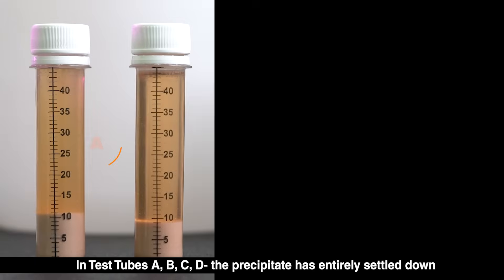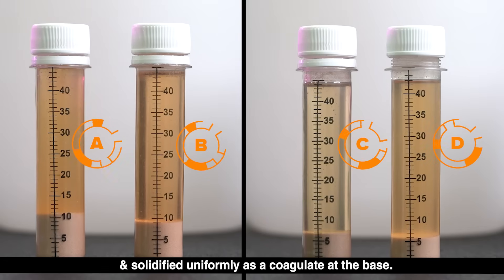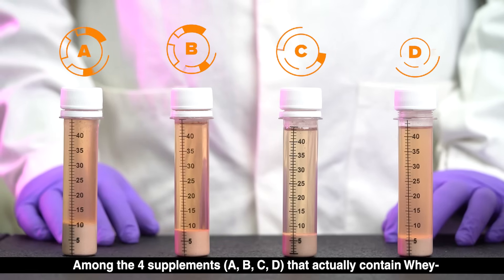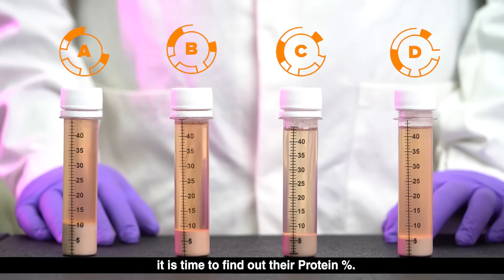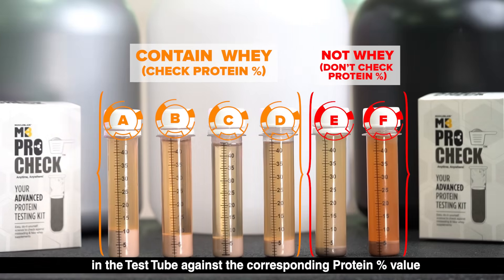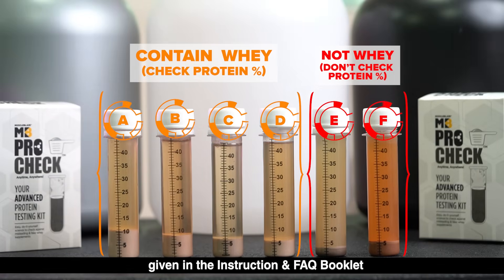18 to 24 hours later, in test tubes A, B, C, and D, the precipitate has entirely settled down and solidified uniformly as a coagulate at the base. Now is the moment of truth: among the four supplements A, B, C, and D that actually contain whey, it is time to find out their protein percentage. Check the precipitate volume readings in ml in the test tube against the corresponding protein percentage value in the protein measurement chart given in the instruction and FAQ booklet.